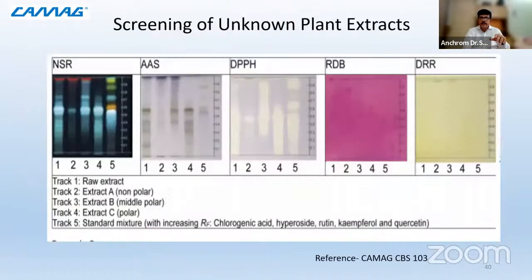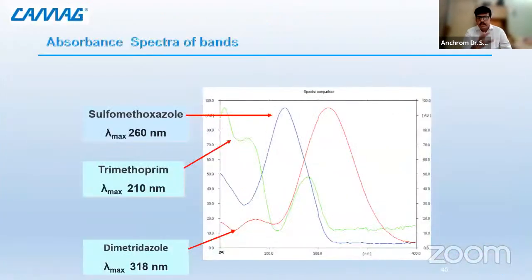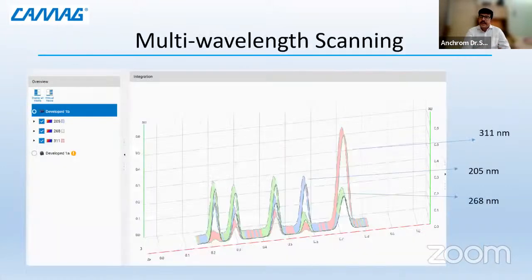Like here, if you see, there are several peaks, but when I'm talking about the spectra, I'm just considering one peak out of this, and I'm comparing that peak with my standard and sample. I'm not comparing many peaks at a time. That can also be done, but right now when I'm explaining the spectra, it is per peak based, that is per component that has been separated. So this is an example of how the overlay can help you segregate and understand whether it is matching with your sample. It can be used for identity and purity.